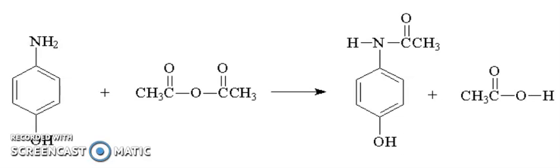After crystallization begins, cool the solution more rapidly using an ice bath. When crystallization ceases, after 15 minutes, collect the crystals as before, rinsing once with a few ml of cold water and air drying. Record the weight of the dry recrystallized acetaminophen.